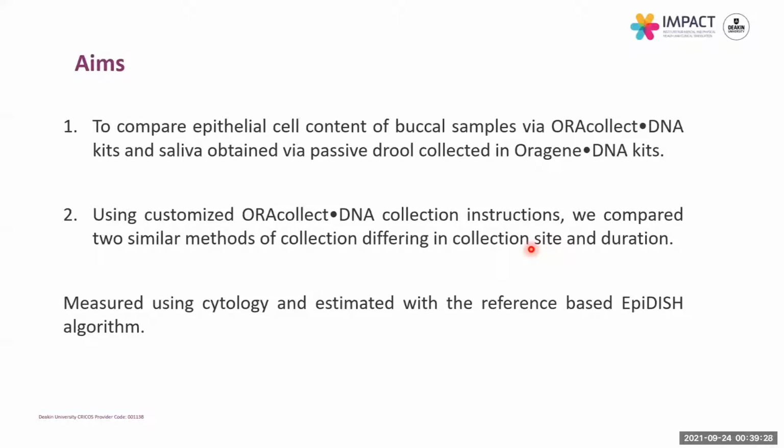So our first aim is to compare epithelial cell content of buccal samples via OraCollect DNA kits and saliva obtained via passive drool collected in Oragene DNA kits. Our second aim is to use customized OraCollect DNA collection instructions. We compare two similar methods of collection differing in collection site and duration. Both of these aims will be measured using cytology and estimated with the reference-based EpiDISH algorithm.